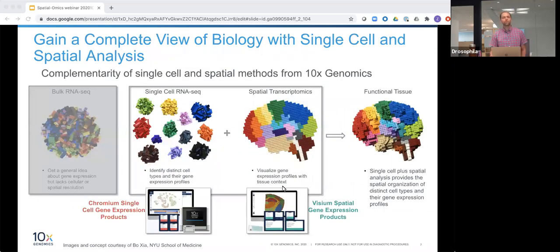I've always liked this picture here, thinking about different RNA-seq methods. As you heard, I've been working on RNA-seq for about 10 years now. Started very early on with bulk RNA-seq, what you see here is Legos on the left. Essentially just a mismatch of all your Legos in a single block, and you kind of get an average. More recently, we've seen huge advances in single-cell RNA-seq, where you can now see the individual cells that make up a tissue. And then you add that to the spatial transcriptomics, and now you can see not only those individual cells, but where they are in space.